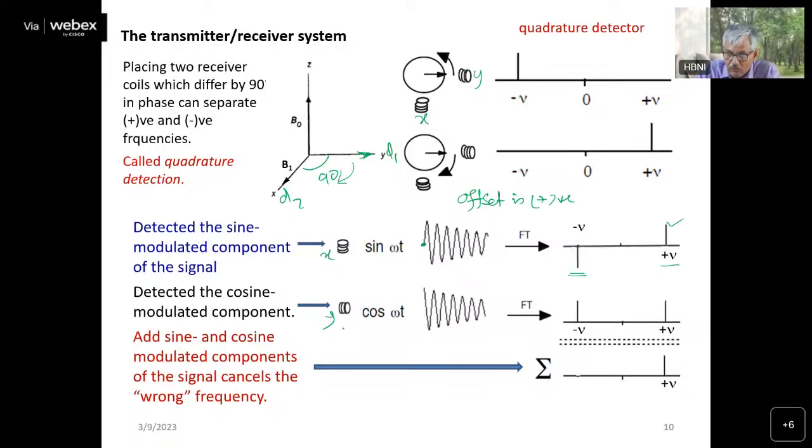Now, if you see the y-axis detector, you will see that for both of them the signal will be positive in the same way, because initially the signal at the detector will be at its maximum, and then it will decay and follow the same path, and you will see both as positive.